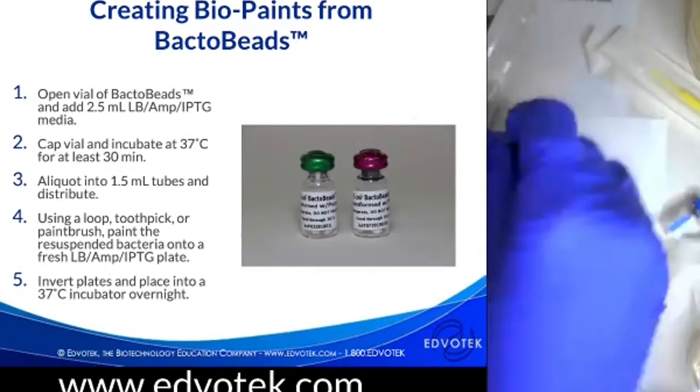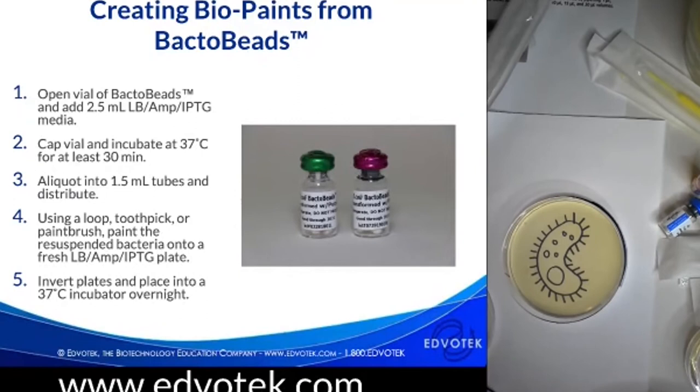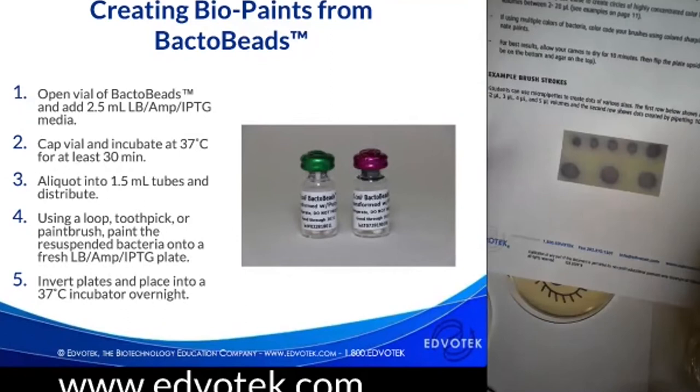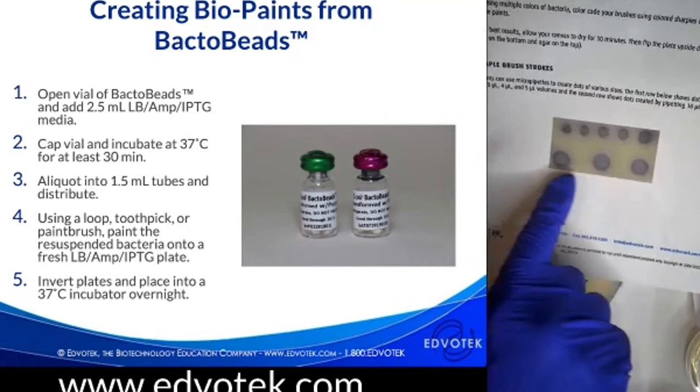Another technique that we can demo here is pipette. So I have this figure here. We do include a whole bunch of tips on how to paint with agar. This is all freely available on our website under this kit. But here is an example of the size dots that you can get when you're using pipettes to make some of your dots.